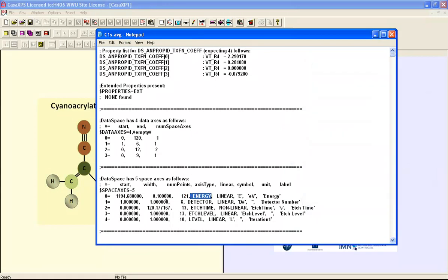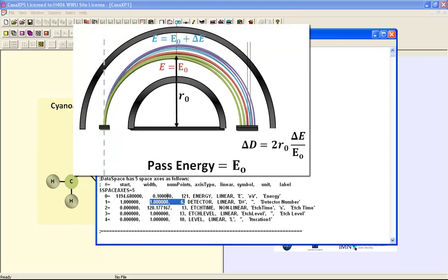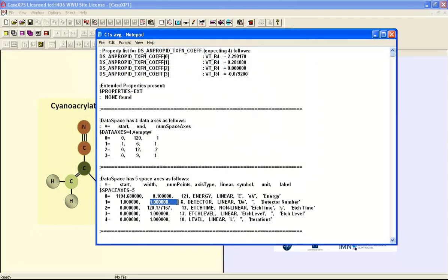So we have a sequence of steps that are made in order to acquire a spectrum. And for each energy range scanned, the signal is separated into six detector streams.